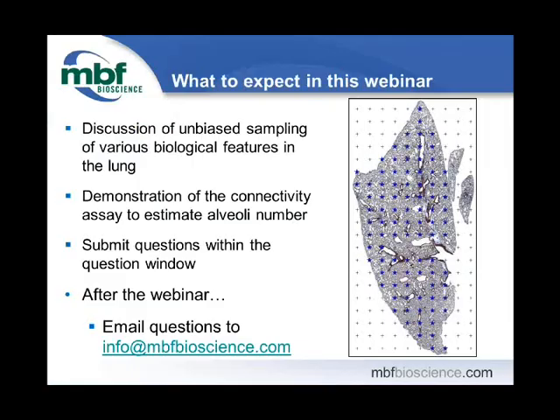Okay, so what to expect from today's webinar. I'm going to start out and give a broad overview of some stereological probes that are useful for lung research. I'll give quick explanations of these various probes that you can use to look for morphological characteristics that are useful to you in the lung.